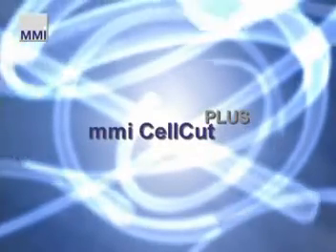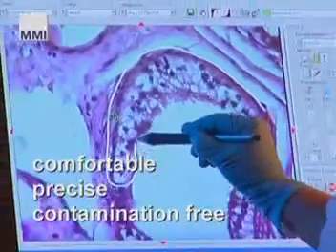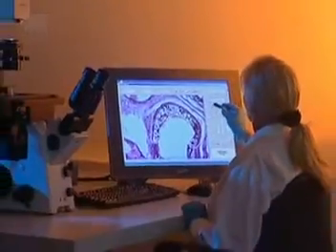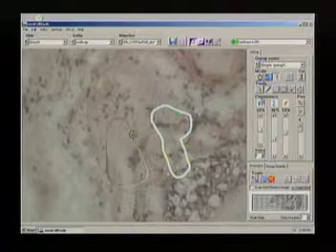The MMI CellCut offers the most comfortable, precise and contamination-free method to isolate a single cell or a whole group of cells. It combines the advantages of high-tech microscopic analysis and intuitive user interface to deliver exceptional results in laser microdissection.